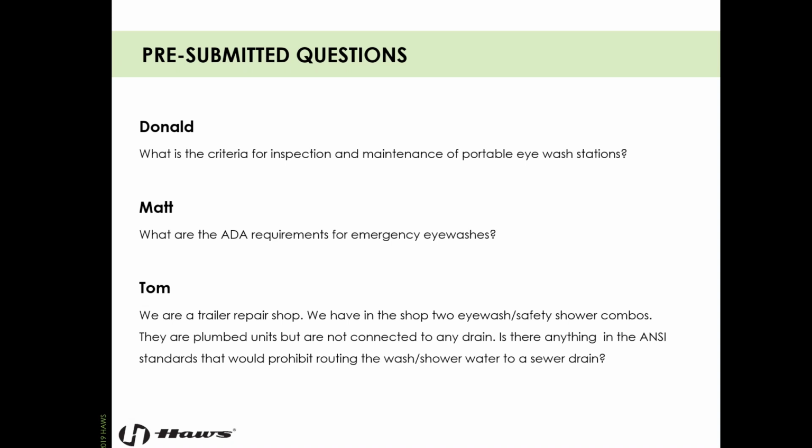Matt asked, what are the ADA requirements for emergency eye washes? What you'll want to reference, or you can revisit us, we do an ADA webinar as well, and we're going to do one in December. I think December 8th, we'll be sending out information soon. I host that as well. You'll want the 2010 ADA standards, chapter 6, sections 602.1 to 602.6. These cover drinking fountains, but they also cover a lot of the plumbing requirements in general. Emergency equipment also has to adhere to this, okay?